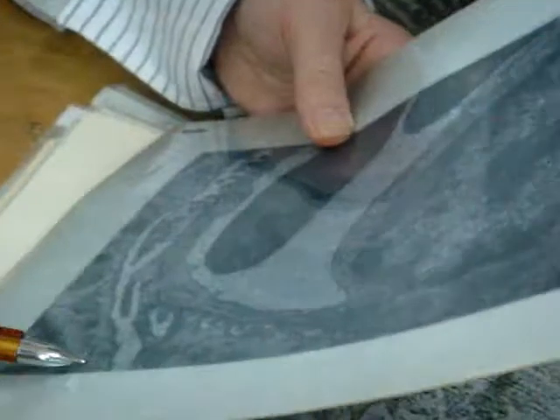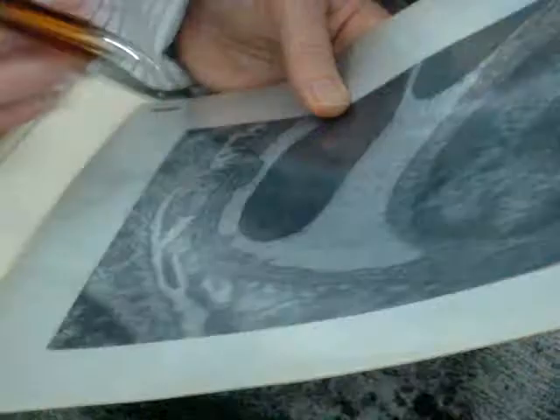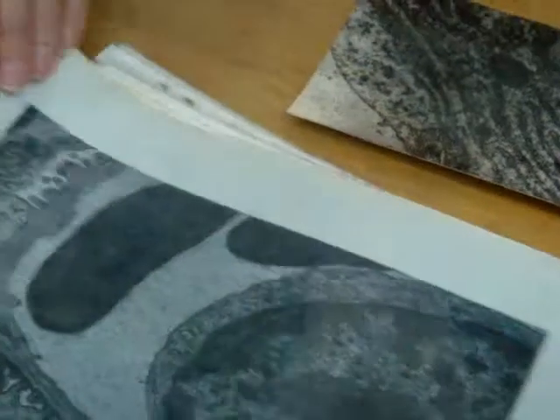No? Again. This is the nucleus of an endothelial cell. In the middle there is another cell. This is part of a podocyte. Podocytes form pedicels on the basement membrane.